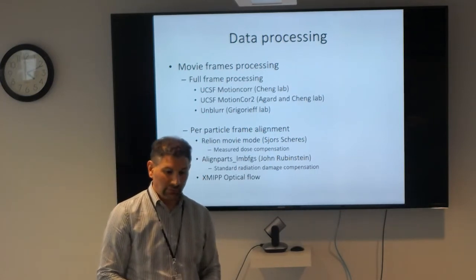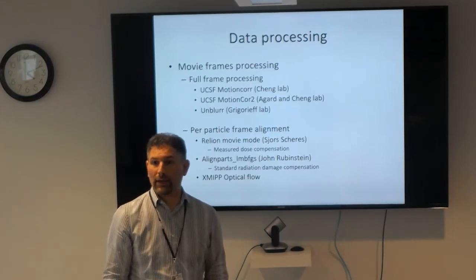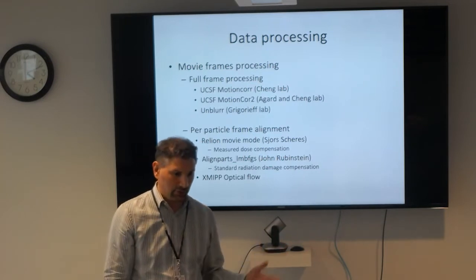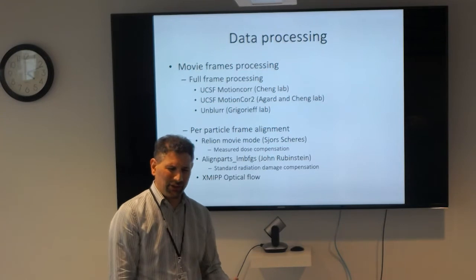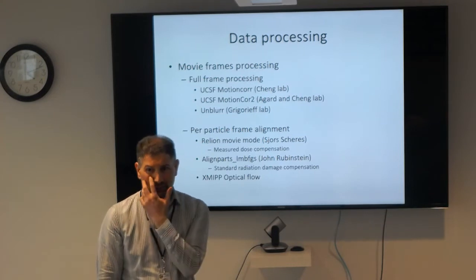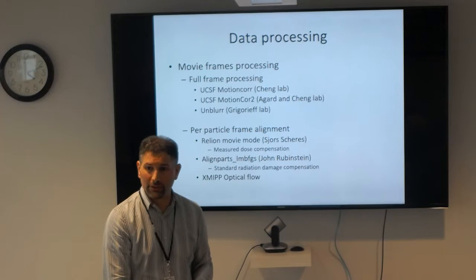So yeah, that's the first time I heard it. I'm like, oh geez, let's give this a try, and it helped out a lot. They use it. Eva obviously has an extremely successful project group going on there, so if they're doing something right, it's worth it. And then there are other things you can do with Relion. We can, for example, ignore CTFs until the first zero. It's got these little flags that end up helping out, and we always use them when we process our data. We can talk about this later.